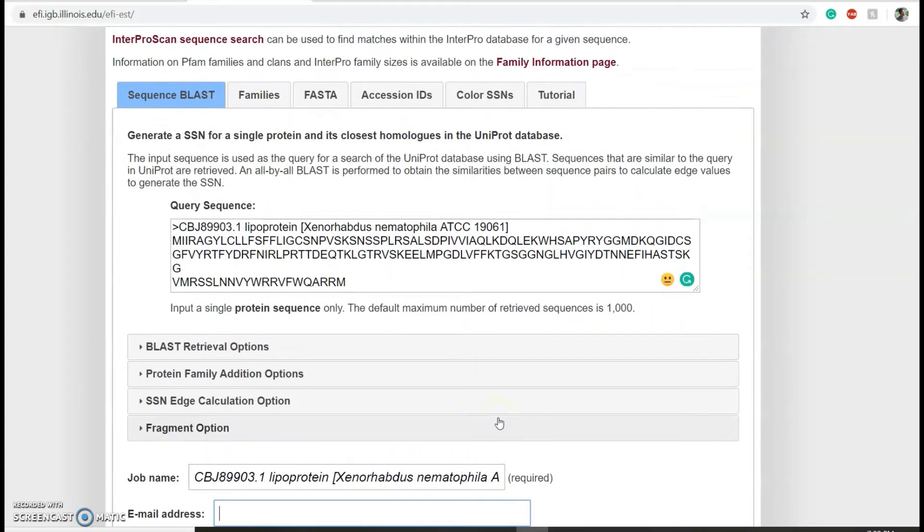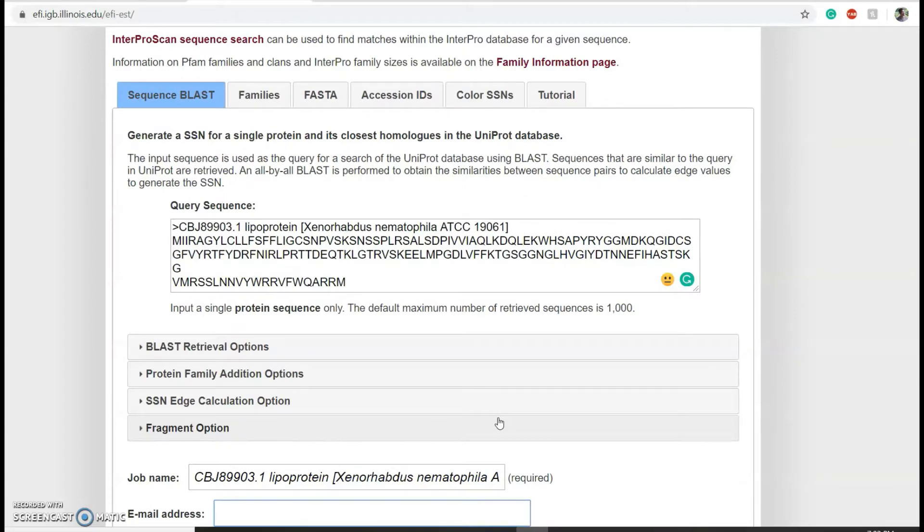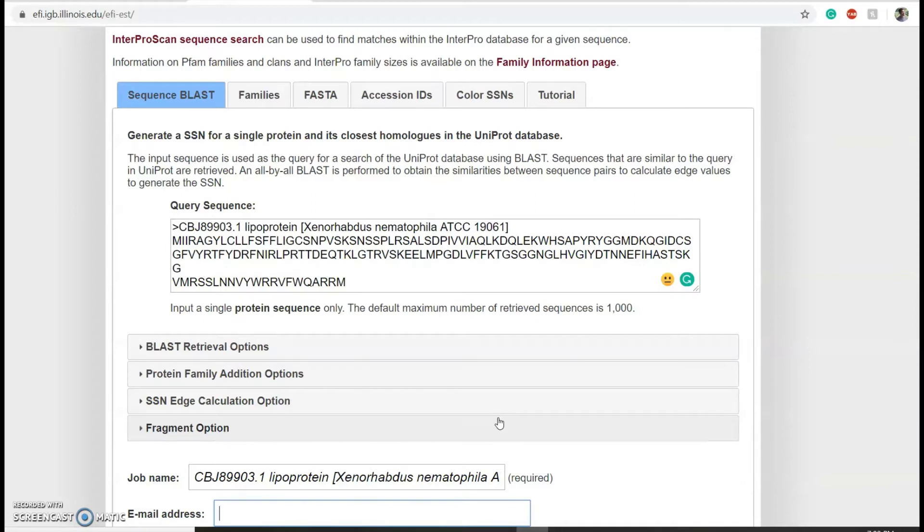Using BLAST, EFI will gather 1000 sequences that are similar to the sequence that I've inputted. You will get an email saying that your request has been received and another email once the initial calculation is completed. I got my results within 25 minutes of submission.